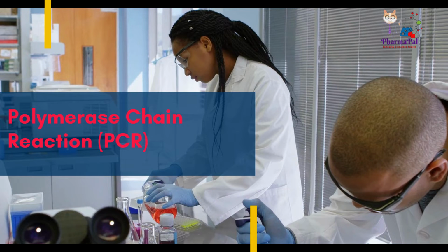It involves using 2 sets of primers, with the second set lying inside the first set, resulting in a shorter product. There are several other PCR techniques, such as inverse PCR, IPCR, and random amplified polymorphic DNA PCR, RAPD PCR. These techniques have their own unique applications and advantages.